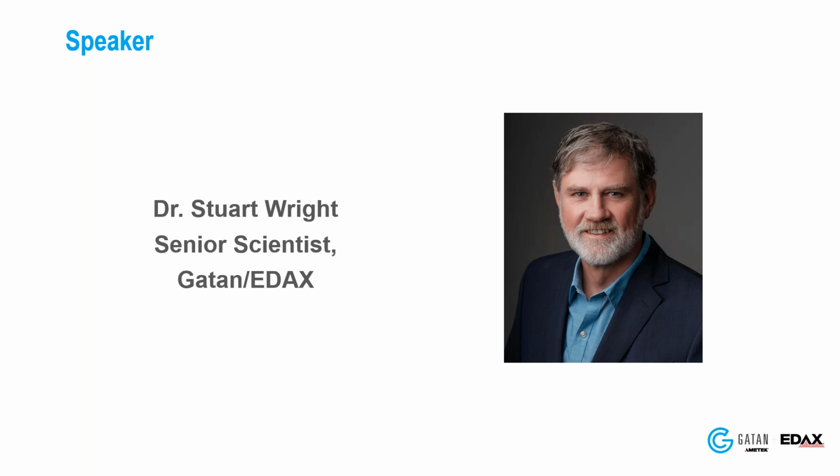The original OIM system at Yale could index approximately one pattern in 3 seconds. Modern systems have come a long way since those early days, with speeds now exceeding 6,700 indexed patterns per second. Stuart is closely involved in the continued development of the technique, as well as in working with scientists all over the world in applying the technique to their materials research.